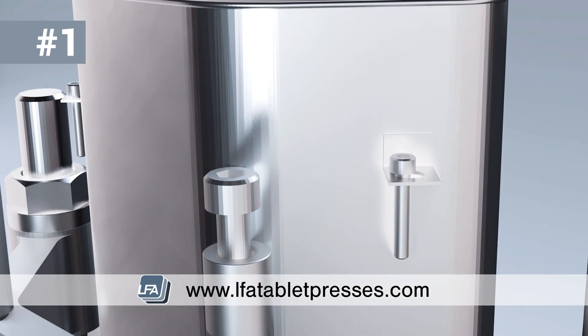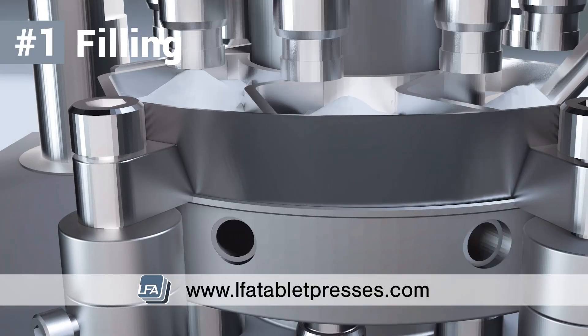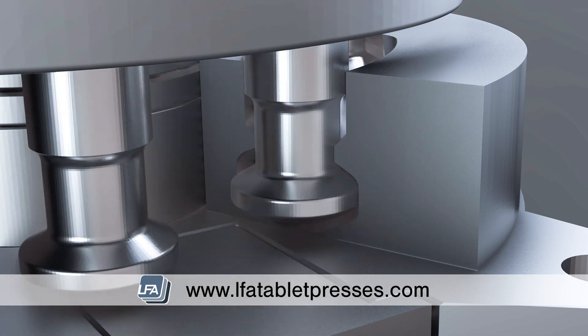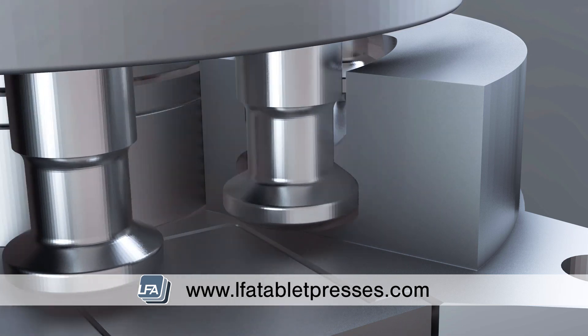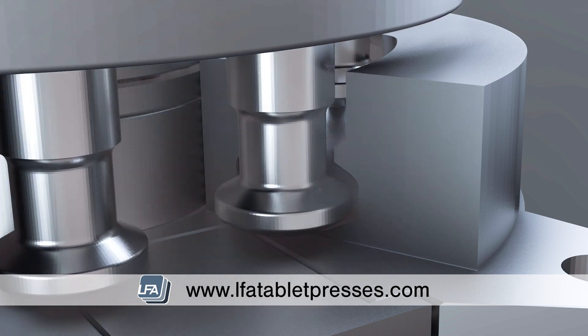The filling stage. A powder mixture is added into the hopper, which flows down into the fill tray whilst the lower punches are pulled downwards by the fill cam. The powder then falls into the die bores by gravity. On some tablet presses, a force feeder is used, which moves the powder over the top of the die face to fill the die bores more efficiently.